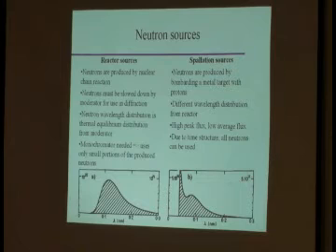And that actually means that people can use all the neutrons in this source. And that's something that is often difficult to grasp at the beginning. How can you use all the neutrons? You have all these different wavelengths. Well, what happens is a neutron is a particle with mass, right? The mass of a neutron is not negligible. So that means that the wavelength is related to the speed at which the neutron travels. The de Broglie relationship, right? So neutrons of different wavelengths that leave the target at the same time will arrive at the sample at different times.